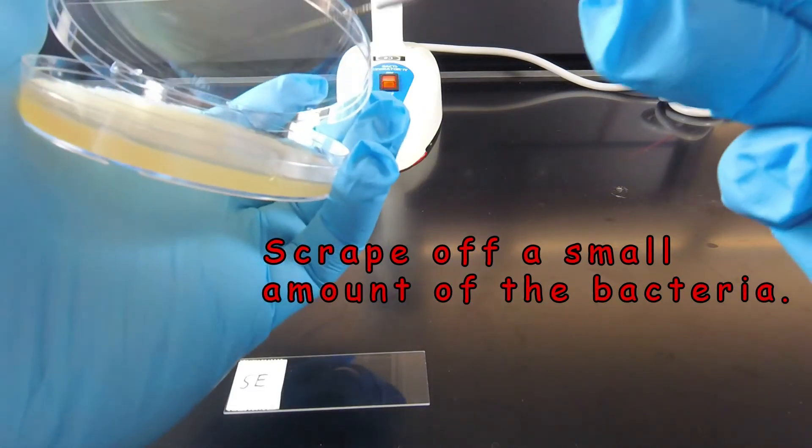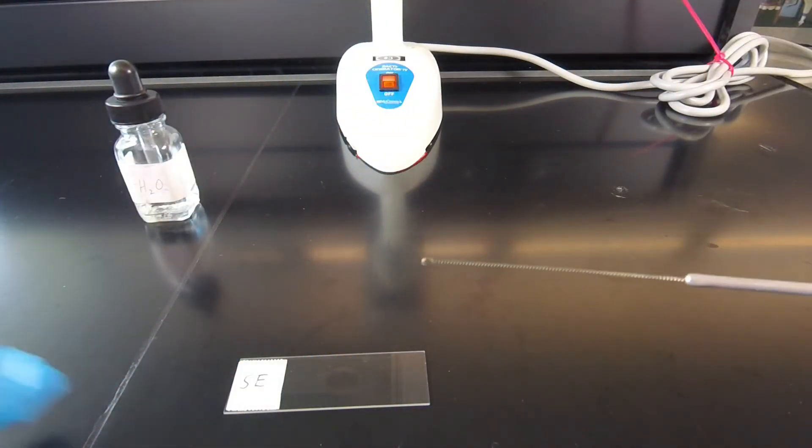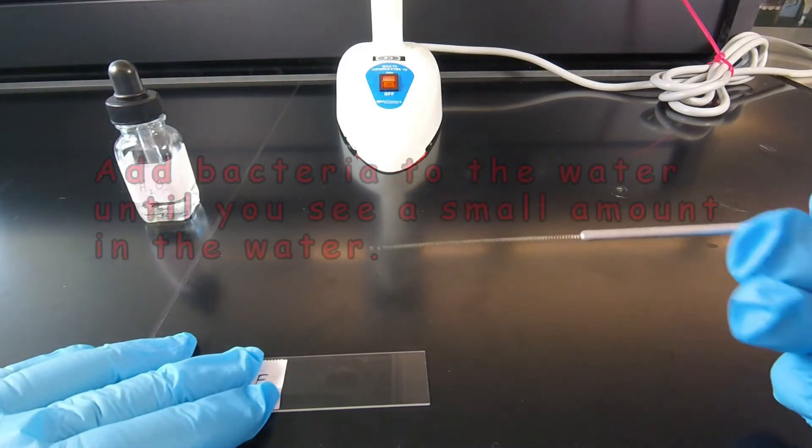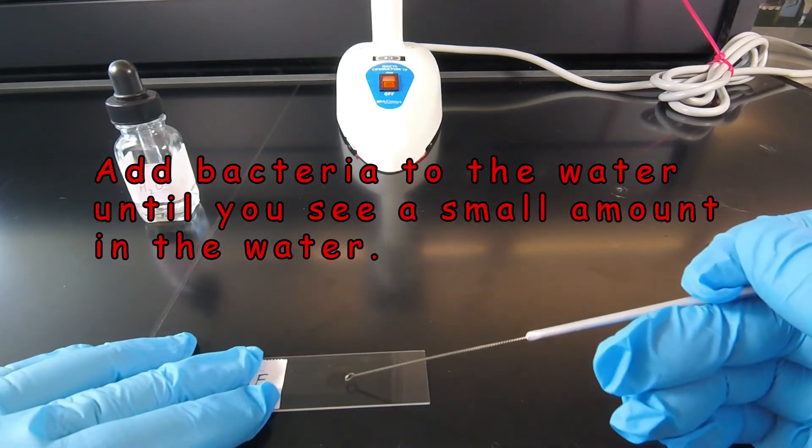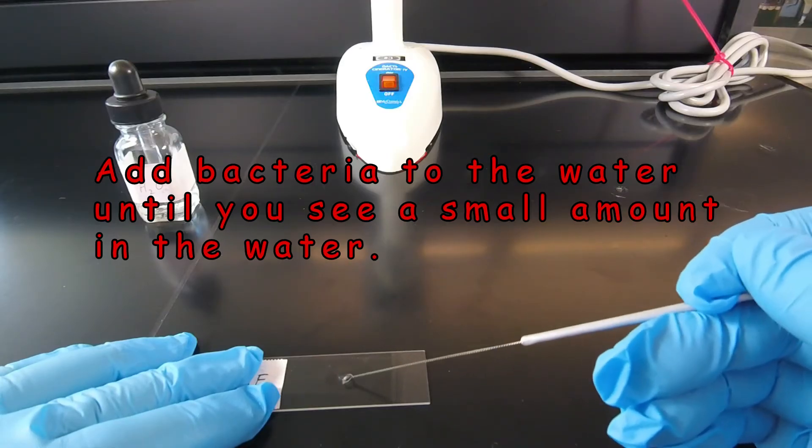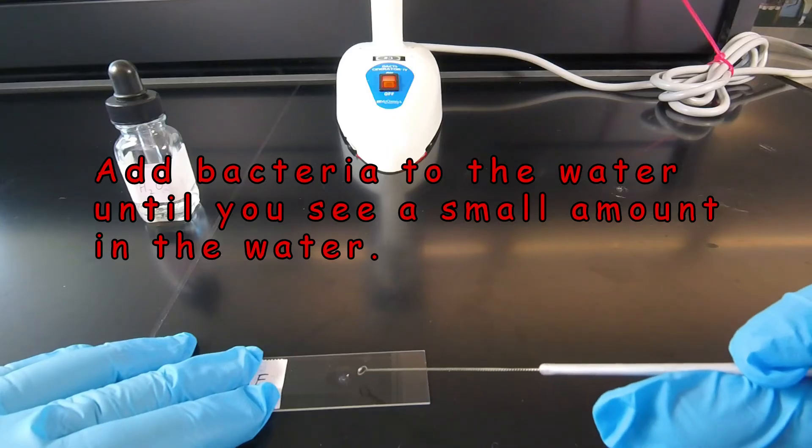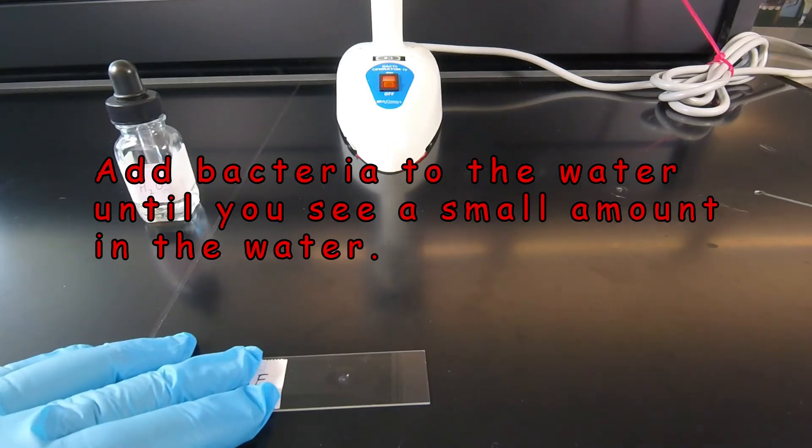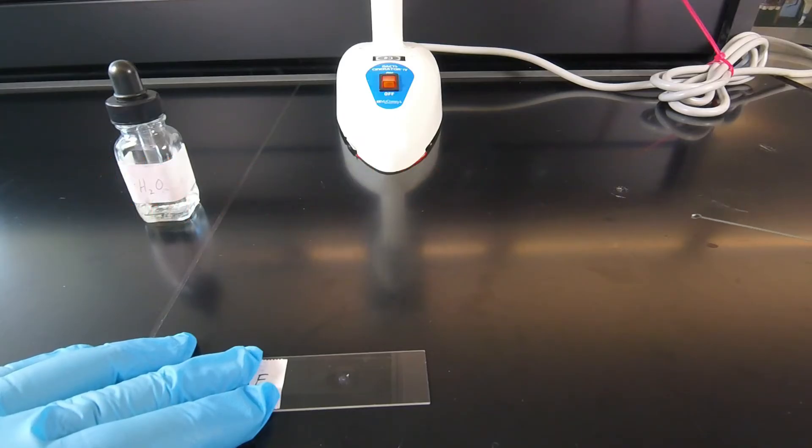We're going to scrape off a small amount of the bacteria. And what we do then is we just kind of slide the bacteria into the water, kind of touch it to the slide several times. There's no set number. We want to slide it in until we can see that there's definitely some bacteria in there. Now if you look closely you can see that we can see there's bacteria in the water, and so that's plenty.